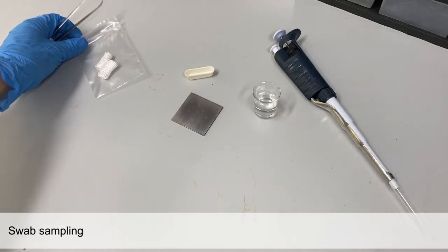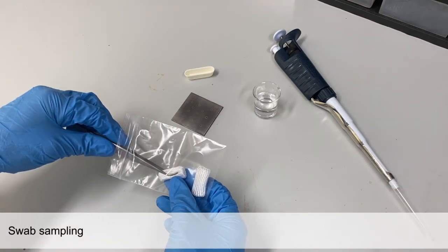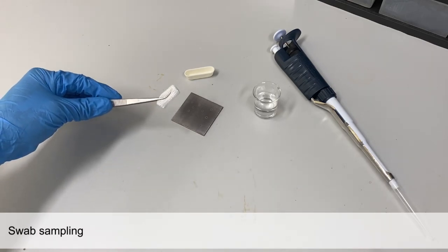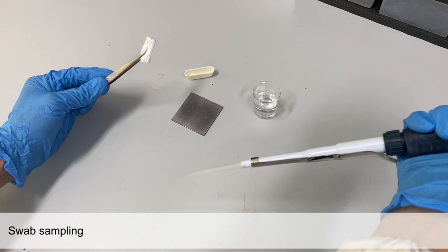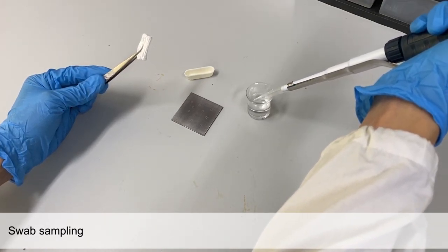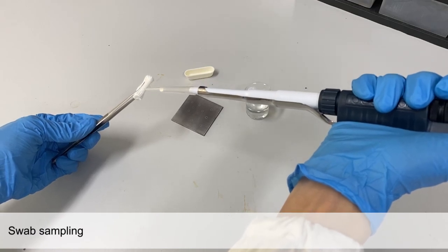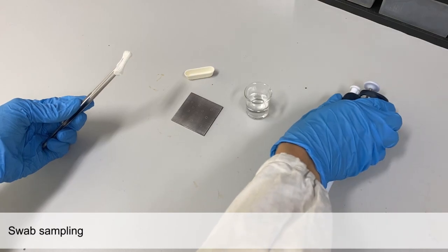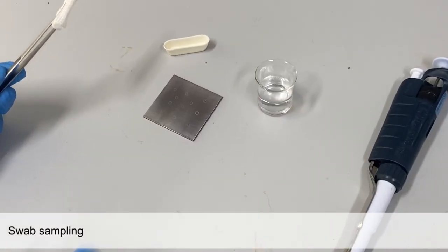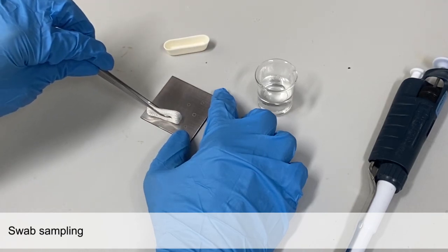We first start by adding some pure water to the swab material. Then, perform a swab sampling of a specific area using the wetted swab.